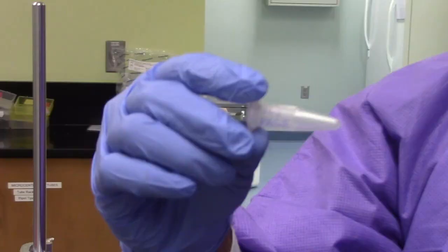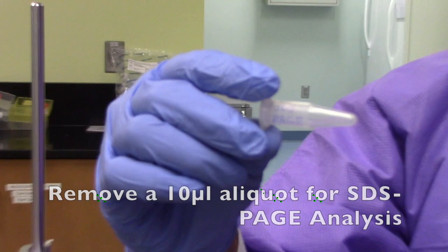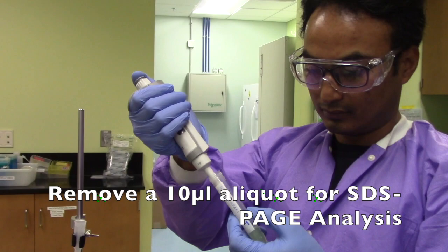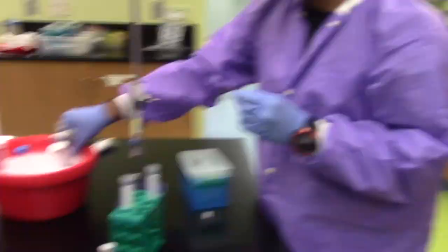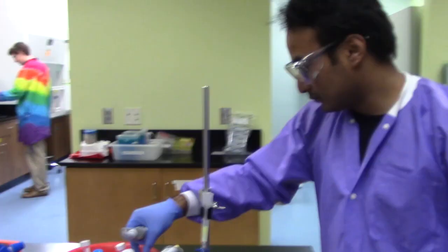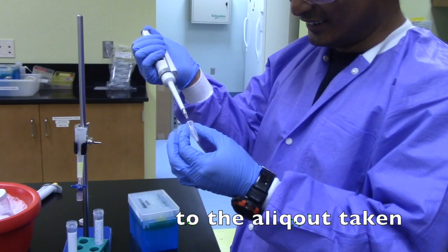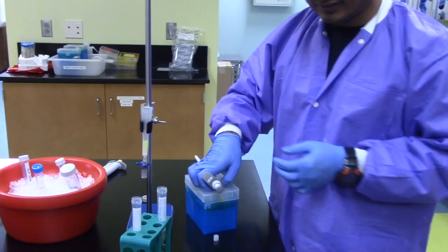Remove a 10 microliter aliquot for SDS page analysis. Add 10 microliters of 2-fold SDS page sample buffer to the aliquot taken. Collect 50 microliters for fluorescence analysis.